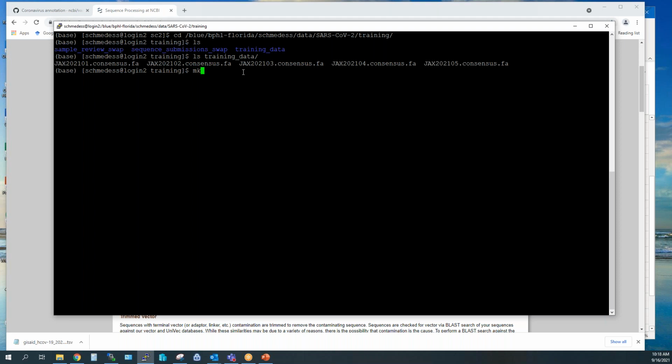But basically what you want to do is go to a space where you're going to do this on HyperGator, in your user folder, and make a directory. I always recommend making directories if you're doing an analysis of any kind, with today's date and any other information that describes what you're doing in there, so that you can go back and know exactly what data is in there and what type of analysis you did. So we're just going to do simple. I'm going to go in there, since we just made that directory.